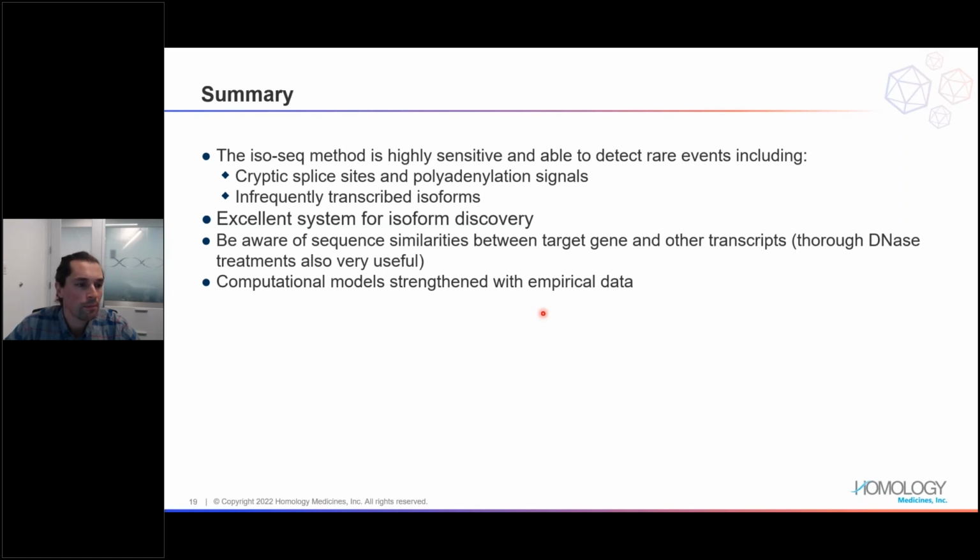Also, again, be aware of sequence similarities between your target gene and other transcripts, due to the hybrid capture. It's fine if they're there, but just be aware of it.